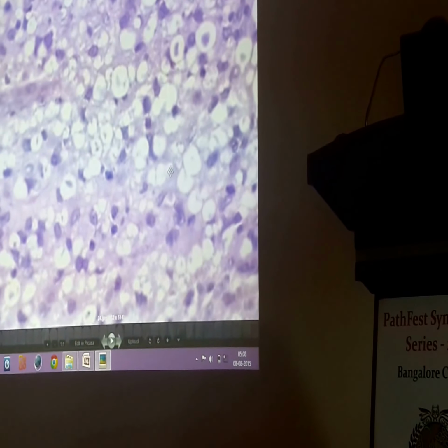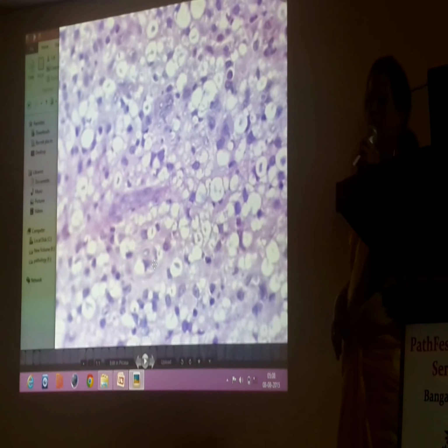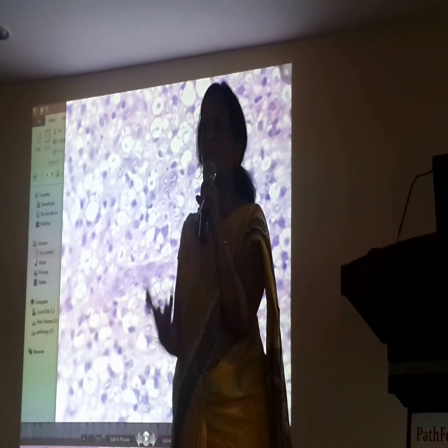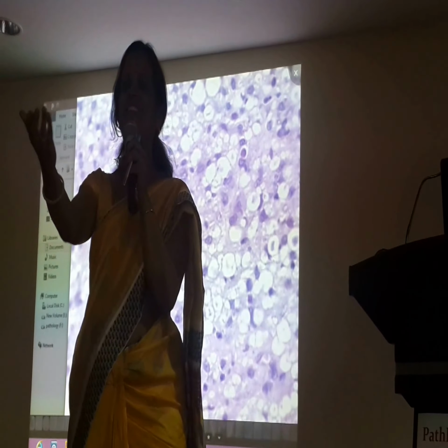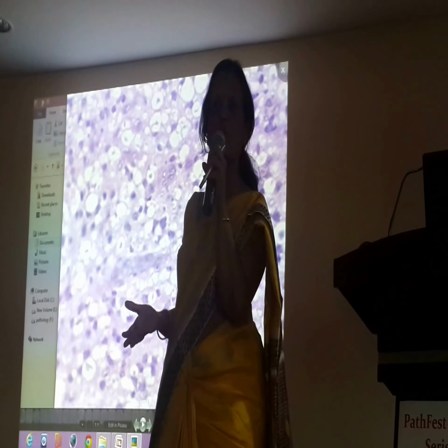I'm telling you, these cells you're very, very familiar with. The cell is telling you, I meet you every day or quite often, though some centers are closed, you know. You keep seeing me, but I'm in a different place now. Yeah. Leprosy. And they're not lepra cells. Don't they have typical morphology?